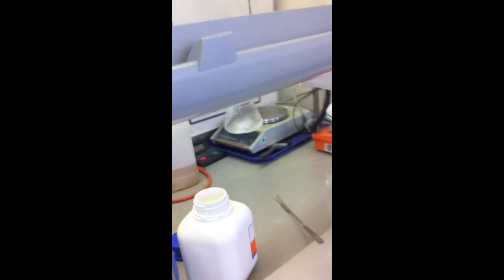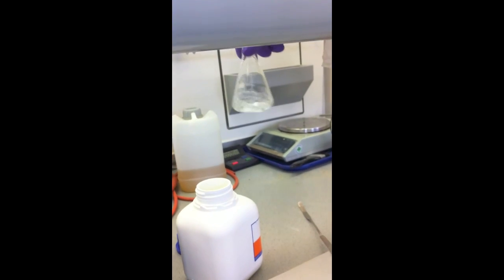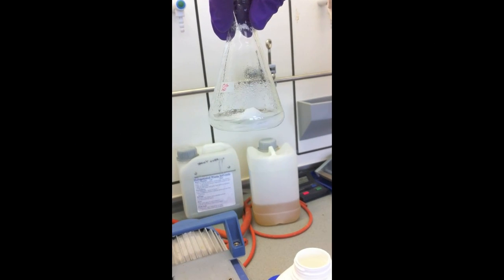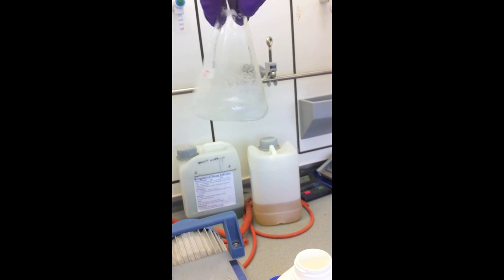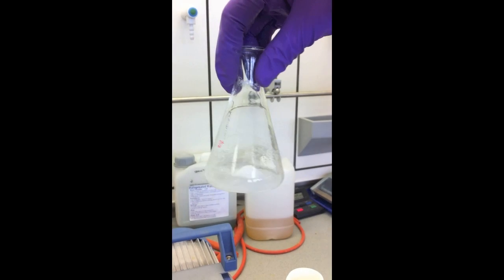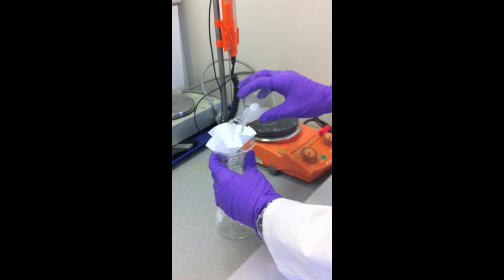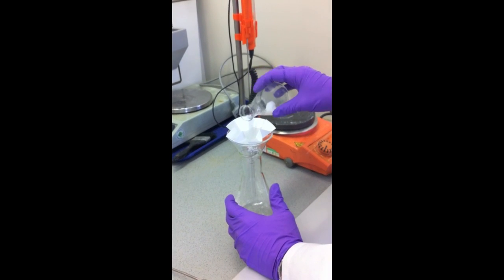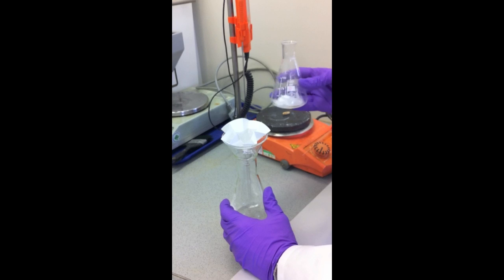Magnesium sulfate is hygroscopic, so it absorbs any remaining water in the solution. It is apparent when all the water has been removed when you get a snowstorm effect rather than clumps of magnesium sulfate. The magnesium sulfate is then removed with filter paper.